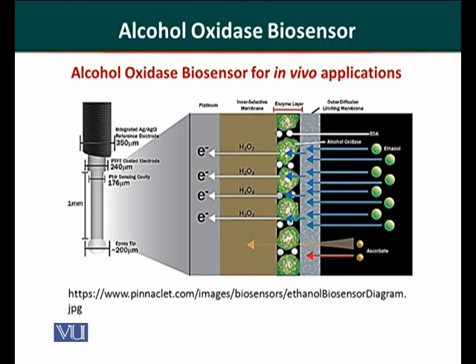In this biosensor we used a silver reference electrode, while platinum based sensing electrodes were used. This electrode also has an epoxy tip that was about 200 micrometer in size. This biosensor was very successful in determining the brain activity of a rat.